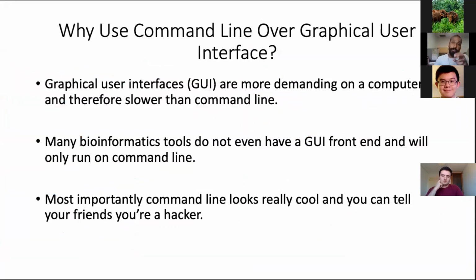So if both the graphical interface and the command line are the same thing, why would you use one over the other? Using the command line is less demanding on your computer because it doesn't have to generate the graphical images that you do see. Also, using command line allows us to navigate and manipulate directories that are not available via the graphical interface.